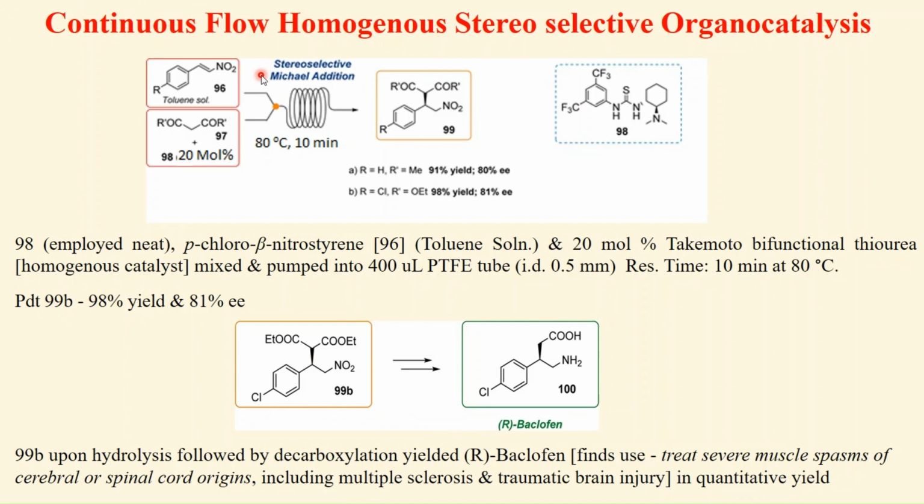Continuous flow system is not only utilized for the synthesis of various APIs or the API intermediates, but also can be used for stereoselective synthesis.